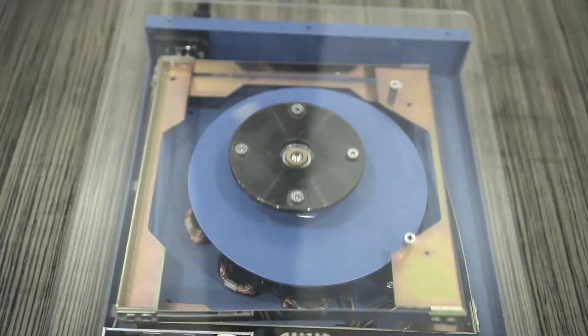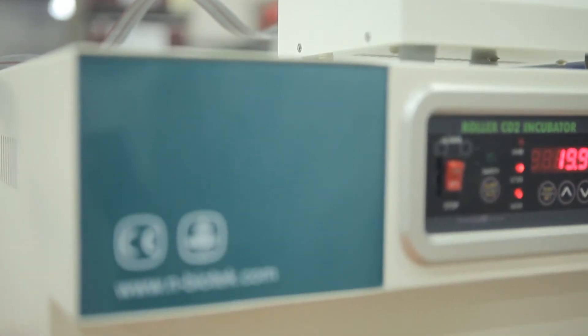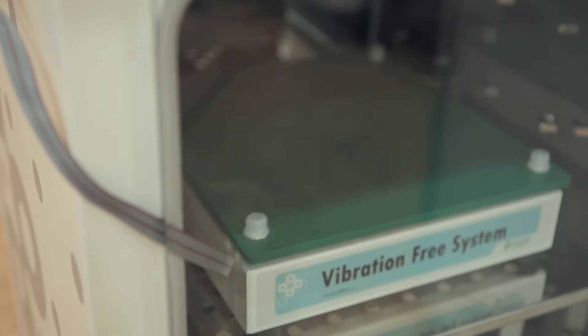It is a moisture-proof product that can withstand an environment of 80 to 90 percent humidity, allowing you to use it in high humidity incubator environments without any problems.